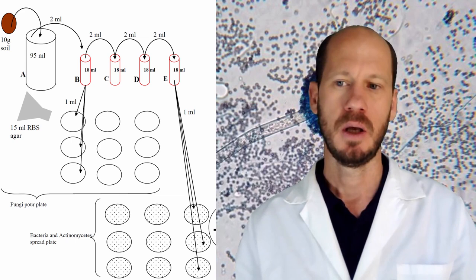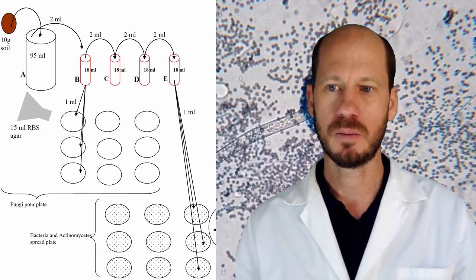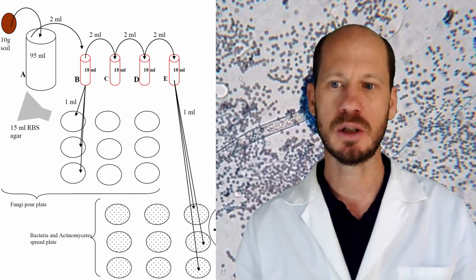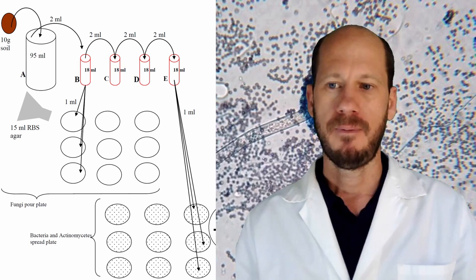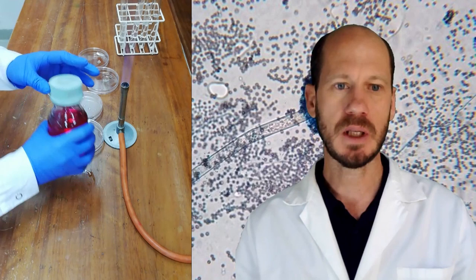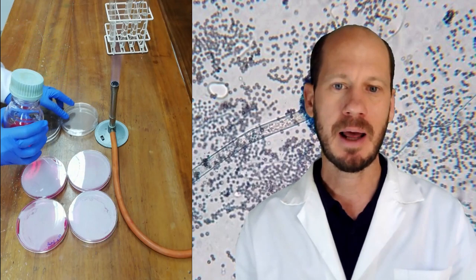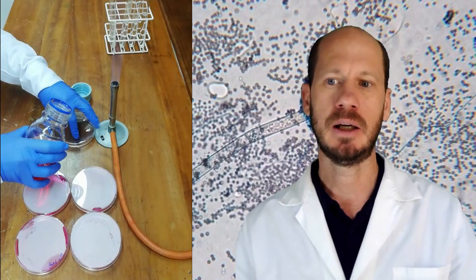Next we will transfer those suspensions into the plates. We will use the first three dilutions — bottles B, C and D — for fungi, and the last three dilutions — bottles C, D and E — for bacteria and actinomycetes. For the fungi we will use the pour plate method, which means we are going to add 1 mL of the suspension to the plate first, then add the rose bengal agar warm before it solidifies, and mix that in the plate and allow it to solidify. After solidifying, we will cover it, allow it to dry a little bit, invert it and keep it in the incubator for a few days before we count the number of colonies.